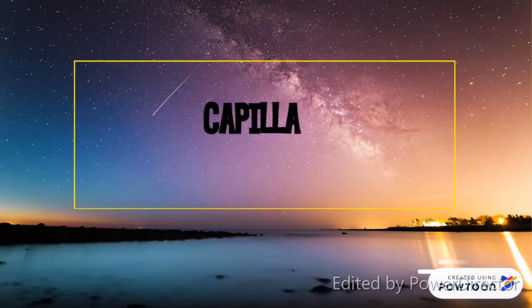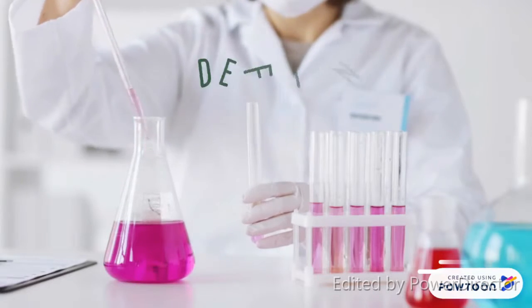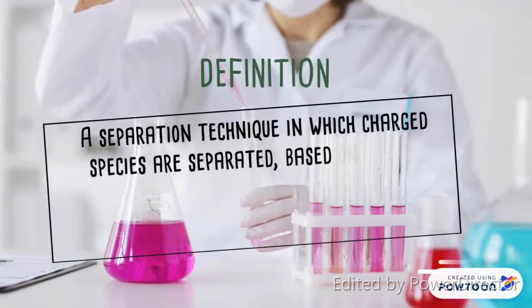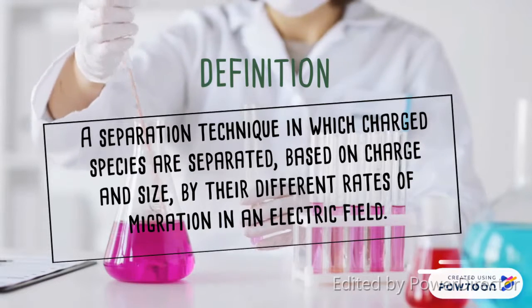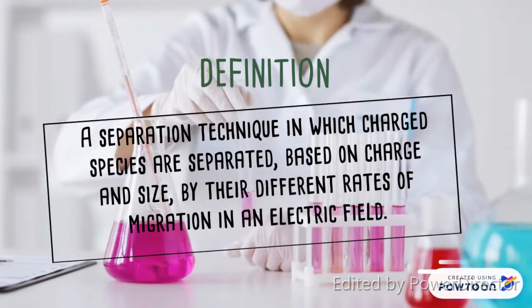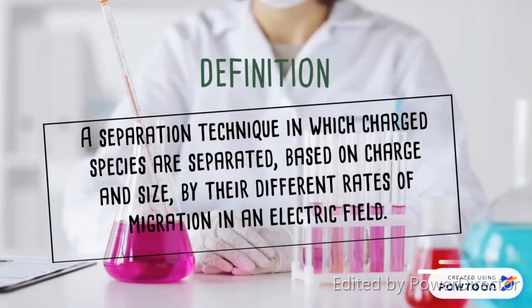Hi guys, today we are going to learn about capillary electrophoresis. So what is capillary electrophoresis? Capillary electrophoresis is defined as a separation technique in which charged species are separated based on charge and size by their different rates of migration in an electric field.